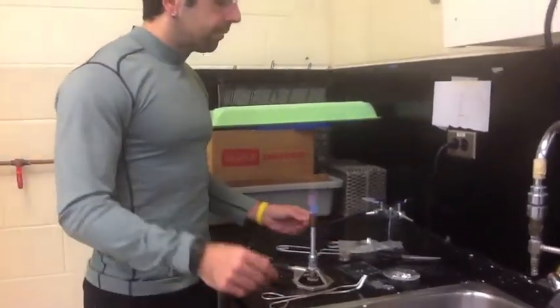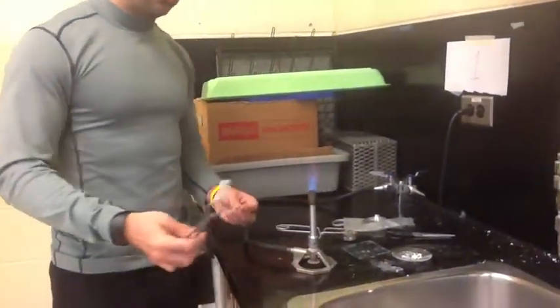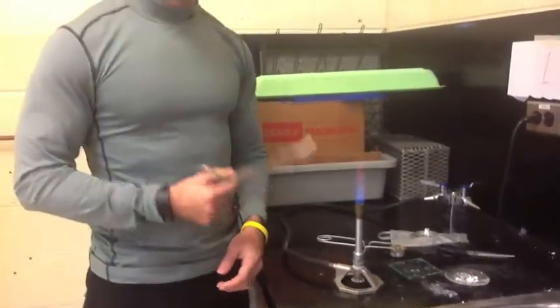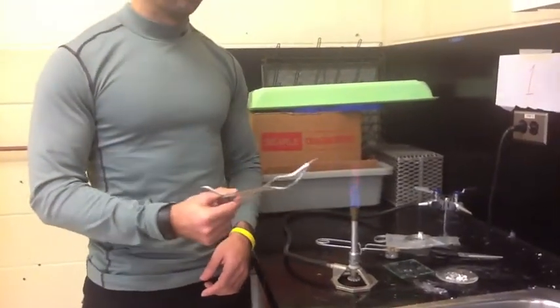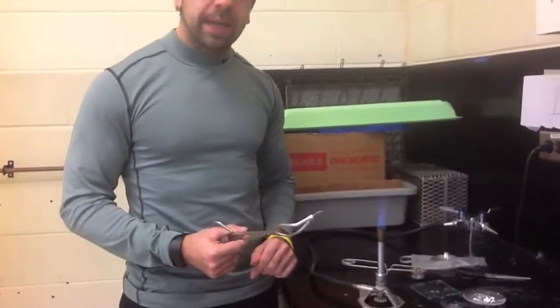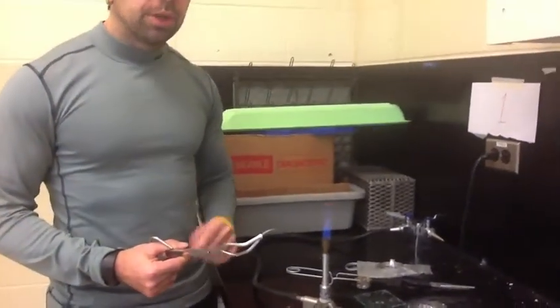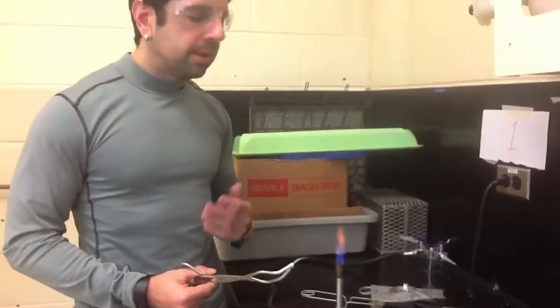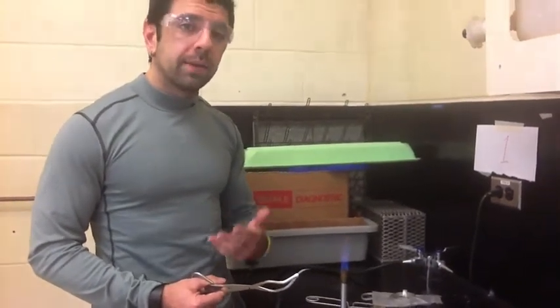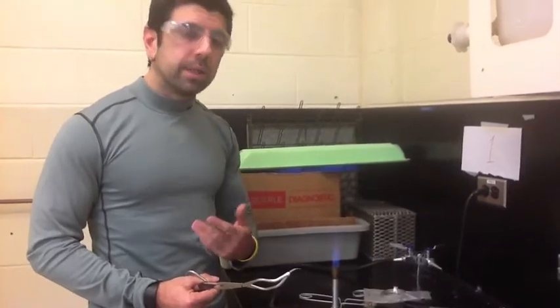Anyhow, for safety, here we've got these metal tongs. You're going to hold your piece of magnesium ribbon with the metal tongs and burn it, preferably holding the magnesium towards the inner blue flame. I'm going to demo this demonstration, and you're going to tell me in the lab report what kind of reaction occurs and what forms.